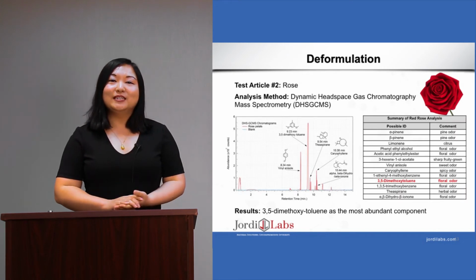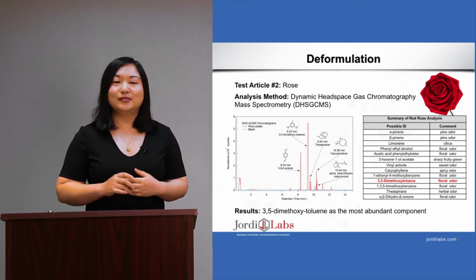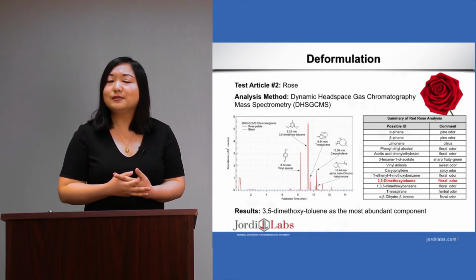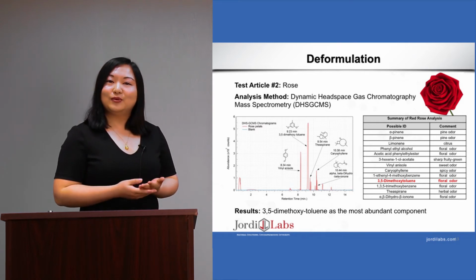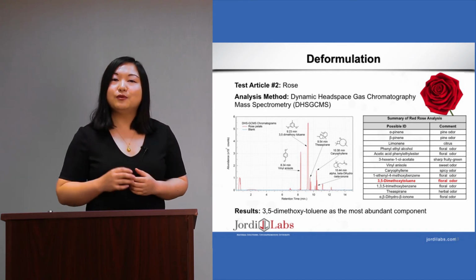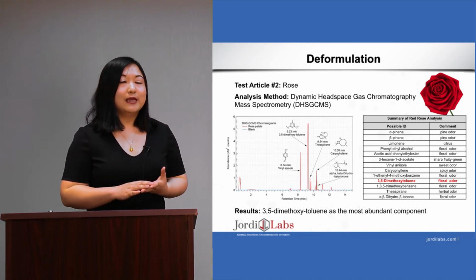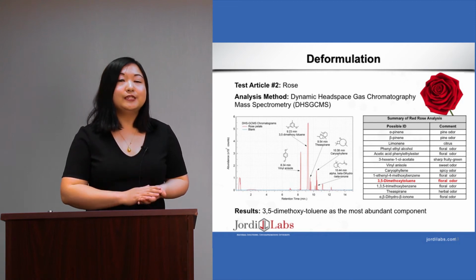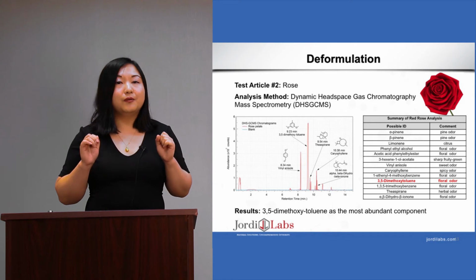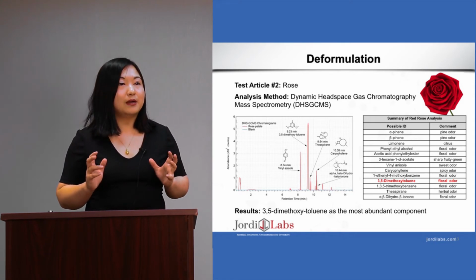And the next project I'd like to discuss is a very fun project. It's a deformulation of rose. Everyone likes roses, but people keep asking us what makes a rose smell like a rose. So we did this project on Valentine's Day, where we took some fresh roses and did headspace GC-MS. As I mentioned earlier, headspace GC-MS is a very powerful technique to give you structure information on the volatile compounds.